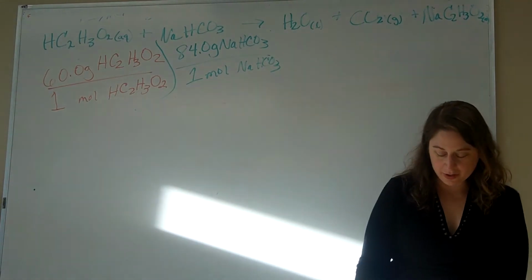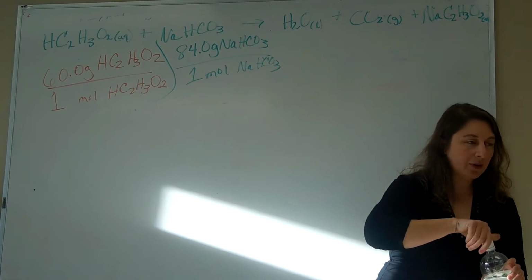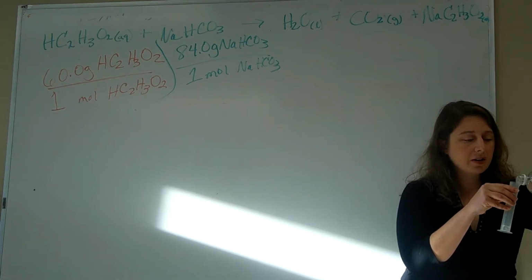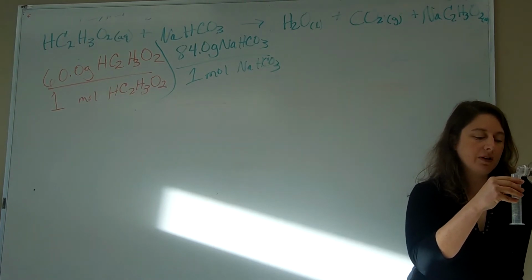So, everybody's going to need their 40 milliliters of vinegar. I want you to measure it out carefully, and I want it to be sitting in front of you while we do this math, because I want you to remember every single lab group is going to have the same amount of vinegar.